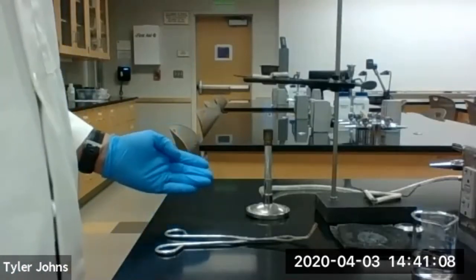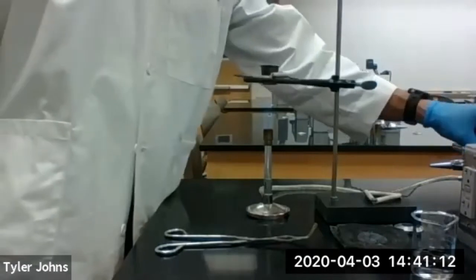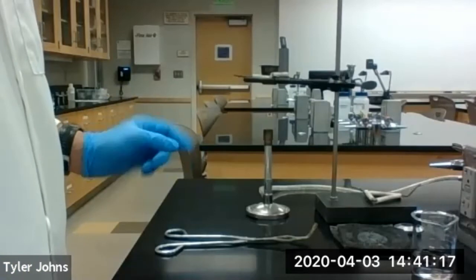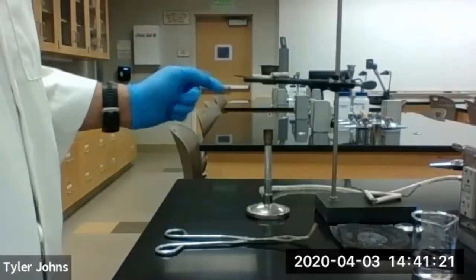Our crucible and cover have been heating for five minutes now, so we're going to go ahead and turn off the flame. We're going to allow our crucible and cover to cool, leaving the crucible and cover in the clay triangle to cool.